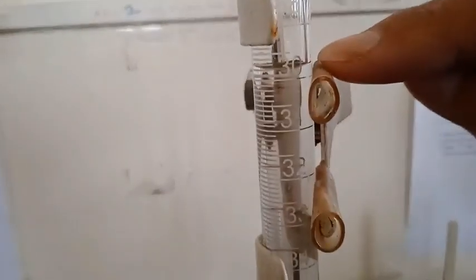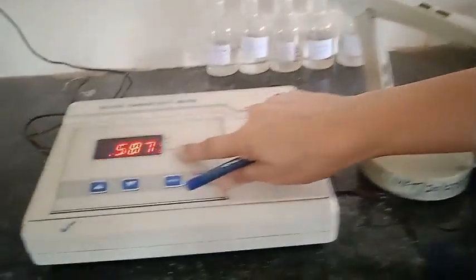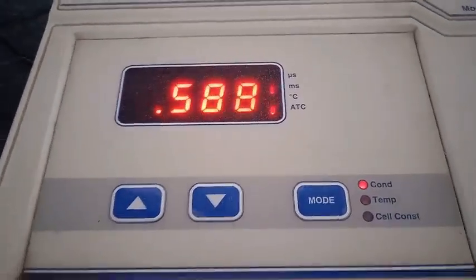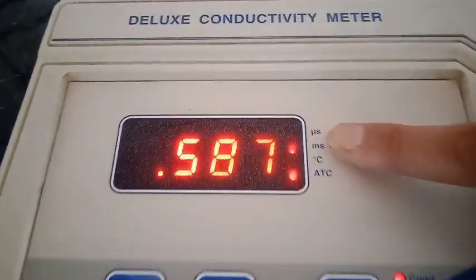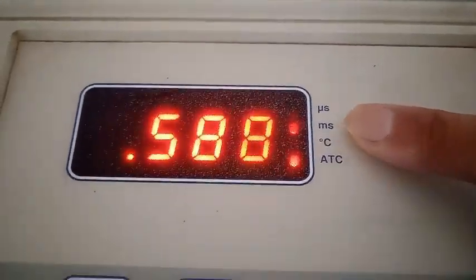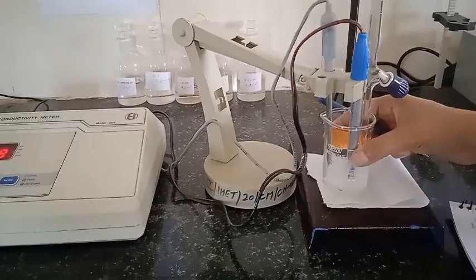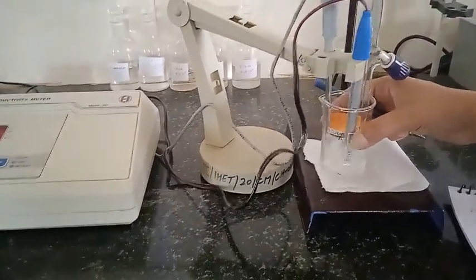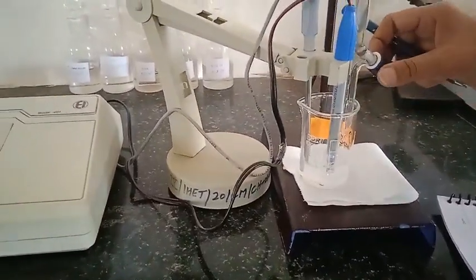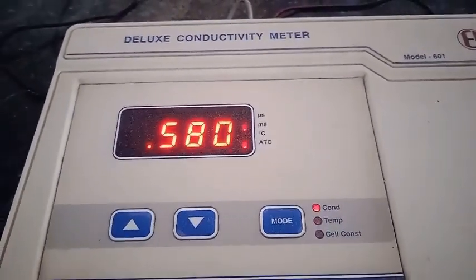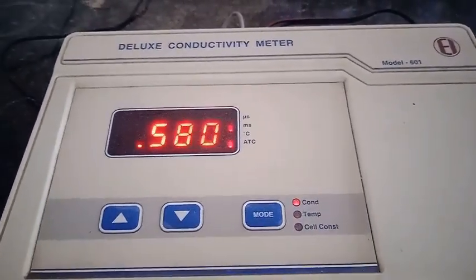Here you can see the burette reading is 30 ml, so 30 minus 29 gives 1 ml added. Now I again add 1 ml of AgNO3 to this NaCl solution and we are going to check the reading. Here you can see this reading is decreasing — 0.580.